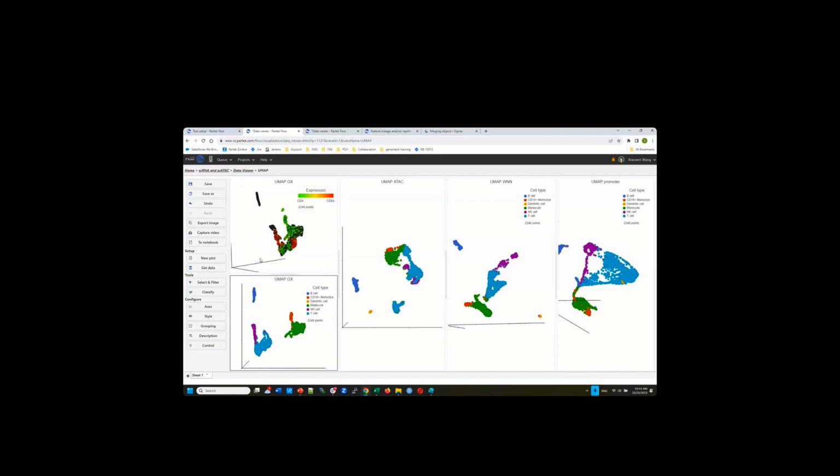So for gene expression, we can see here, this is the T cell, and those parts have a high expression of CD4. In the middle, they have a high expression of CD8. Well, you might have to use other evidence to see those are different populations, right?